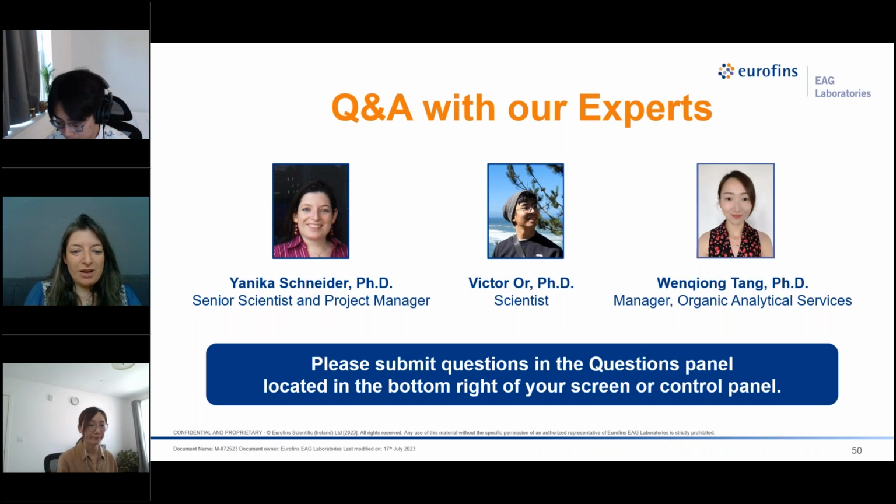Wonderful, thank you. Okay, Wenchong, are you able to use FTIR and/or Raman to detect surface defects? I would say the general answer is yes, absolutely. More specifically, there can be many different types of defects.